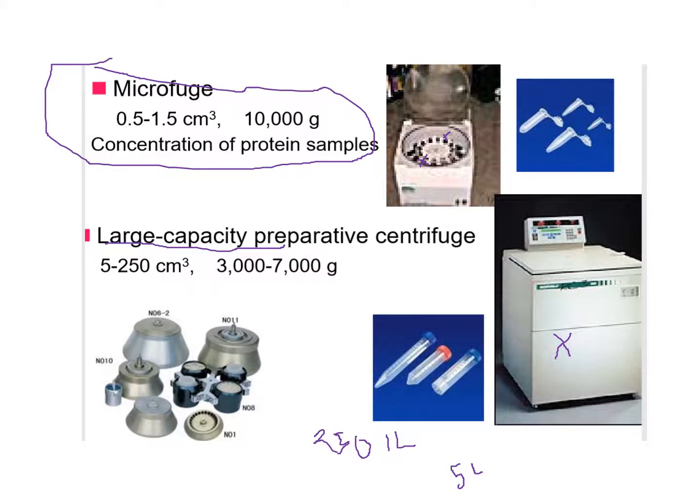You're saying, how do you stop failure? Well, the rotors have a life, and you have to keep records, and eventually they get derated. That means you can't spin them as fast. It's kind of like an old car. You don't want to try to top it out after 15 years of driving. It probably couldn't handle 100 miles an hour, okay? But a brand new car probably could. So it's called derating the rotors.